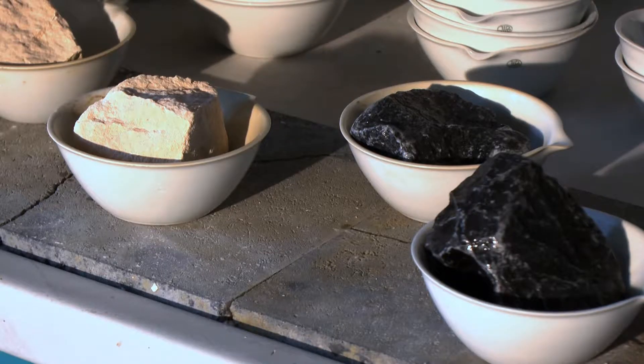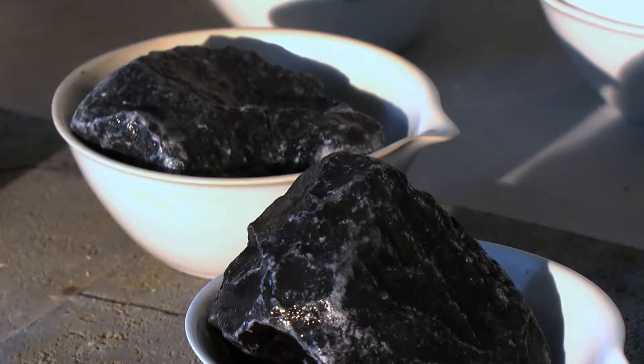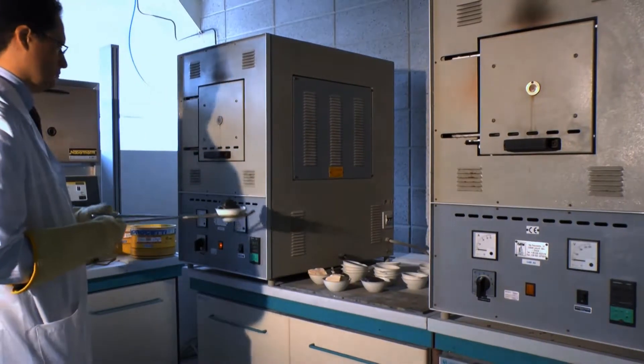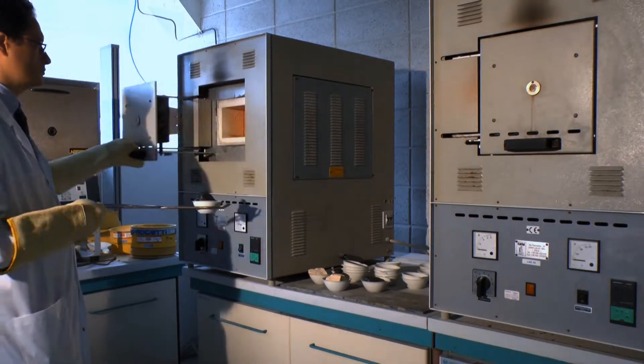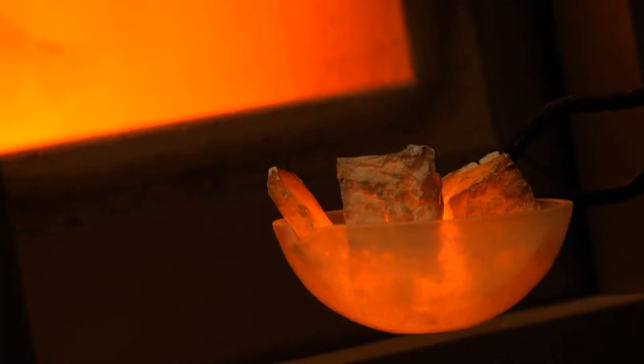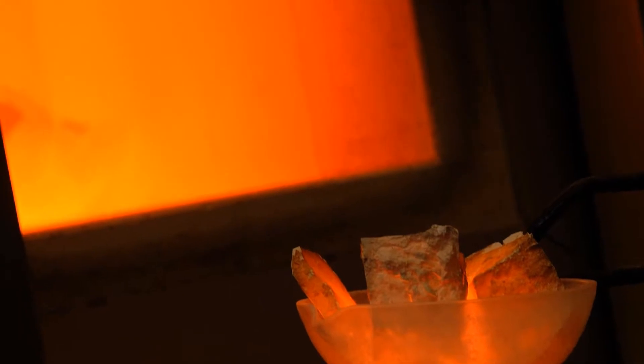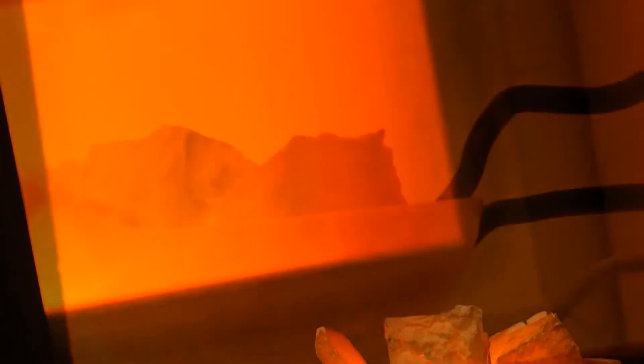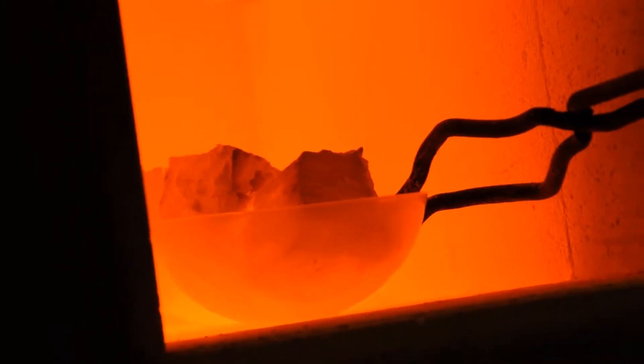The burning attitude is evaluated with a standard burnability test which is approximately equivalent to a thermo-gravimetric analysis but is carried out on bulk rock samples, considering the ignition loss after a certain time at a certain temperature.